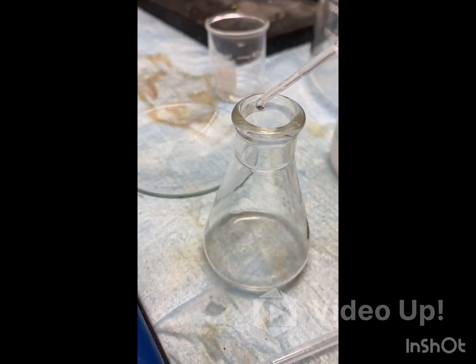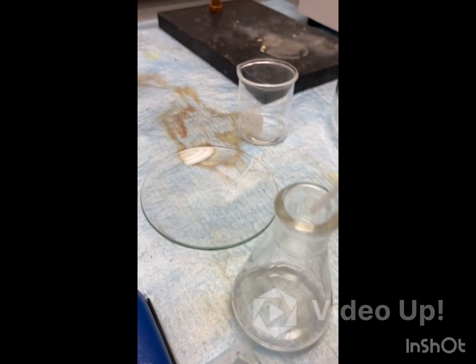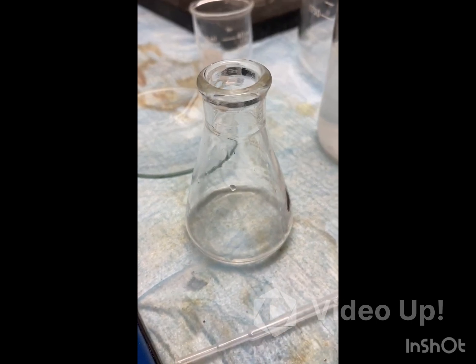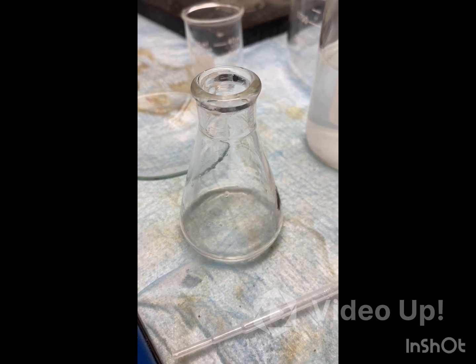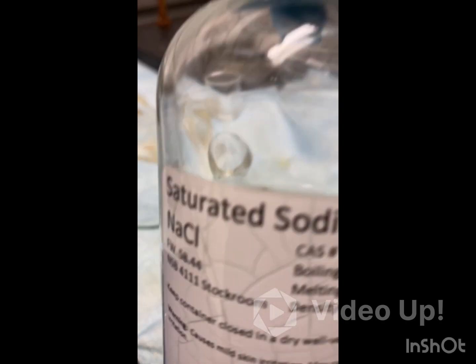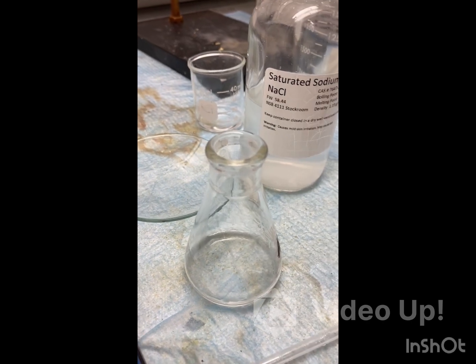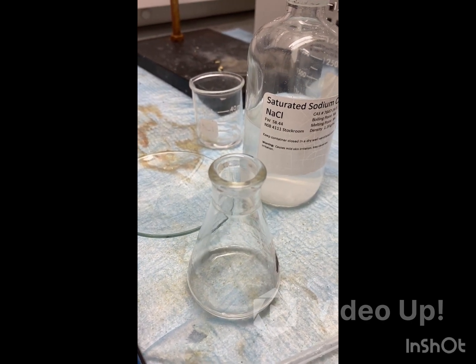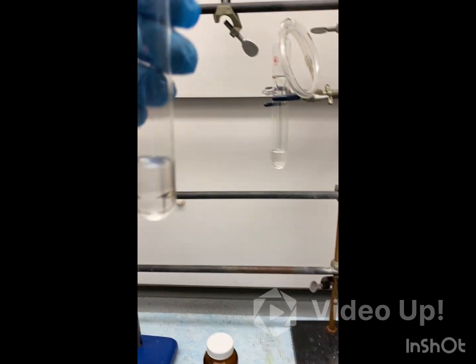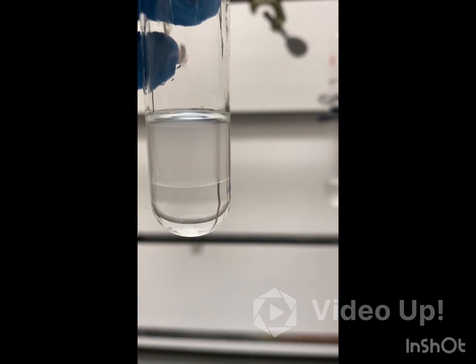We have our extracts. We're going to wash with approximately 2 ml of water, then take the top layer. After that, we're going to wash again with 2 ml of saturated sodium chloride, again take the top layer, and then dry that with anhydrous sodium sulfate. As you can see, we definitely have 2 separate layers, and again we're going to take that top layer.